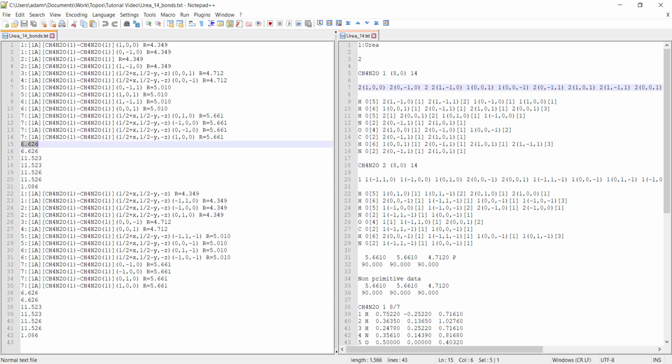So what's going to happen when you're running simulations in CrystalGrower is you're going to be changing these values. So you're going to look at these interactions and make some educated guesses based off of solvent coordination. Is it a hydrogen bonding solvent? Is it a polar solvent? And that can help you make some judgments on what energies should be largest.